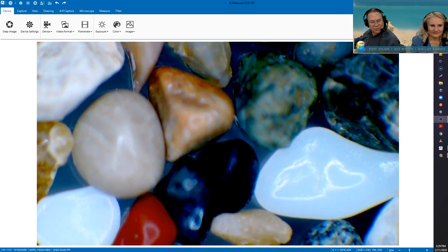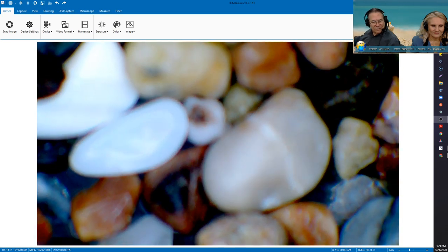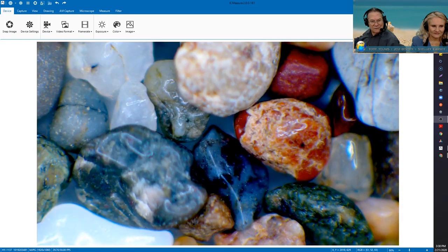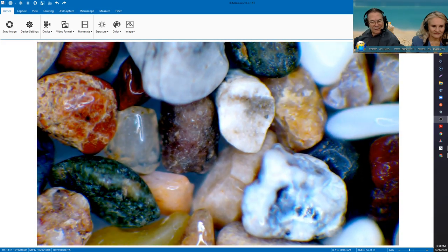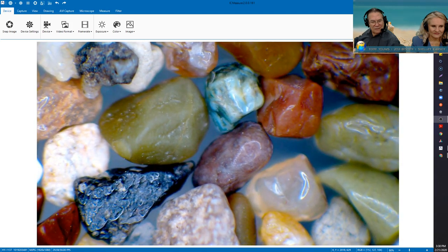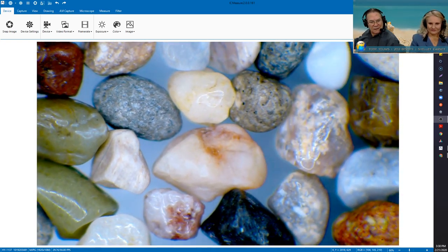And when it's that white and polished, like that one right there over to the left side, that tends to be shell fragments, but I don't see many of those in this sample. I see rocks of all colors and categories and mixtures, but not a lot in the way of quartz. So very different sample from what we've seen in the past.